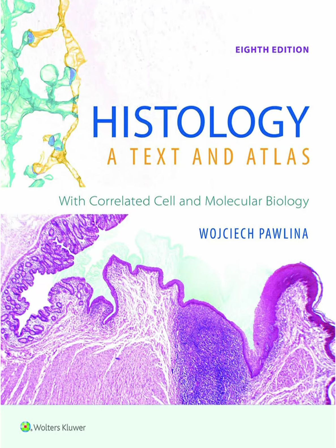Okay, right, let's unpack this then. Before we even get near a microscope, there's a huge amount of work that goes into preparing these tissue samples. You mentioned the workhorse method, the one you'd see first in pretty much any histology lab, hematoxylin and eosin, H&E staining. H&E, that's the one. Usually after something called formalin fixation. Fixation, okay. That's right. The first critical step is fixation.